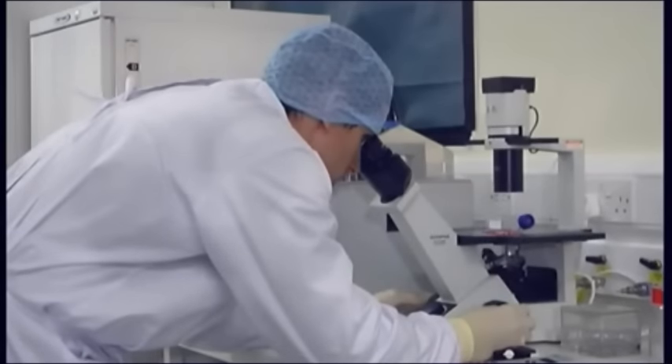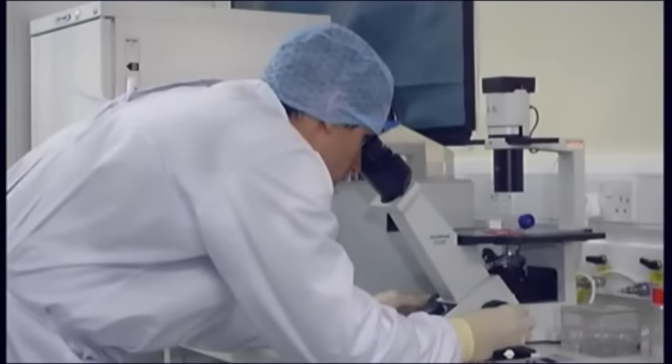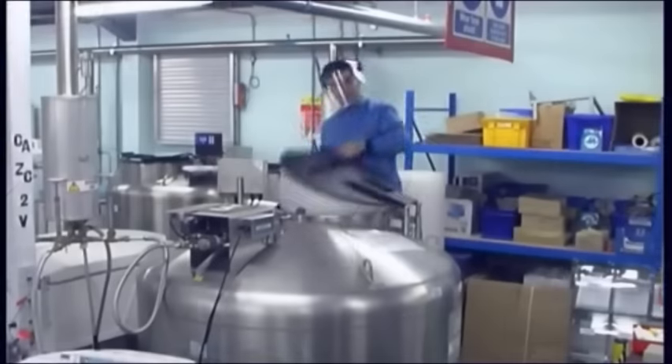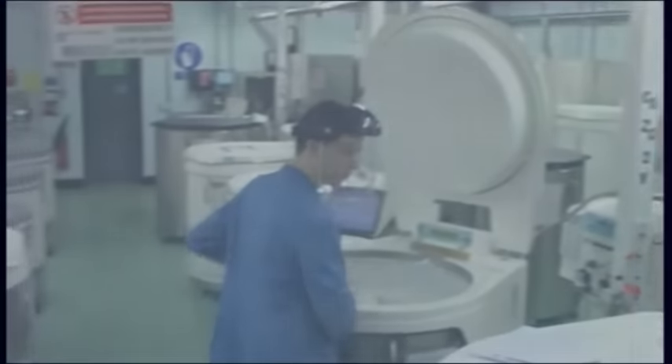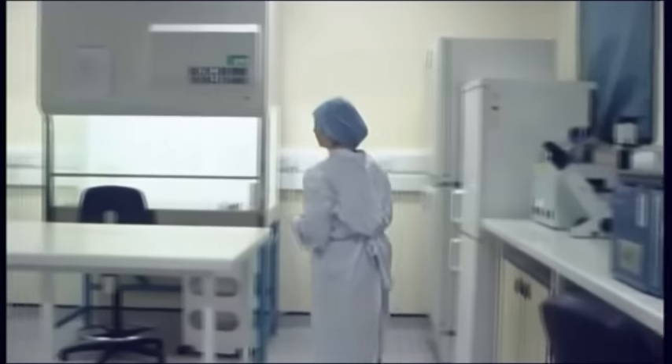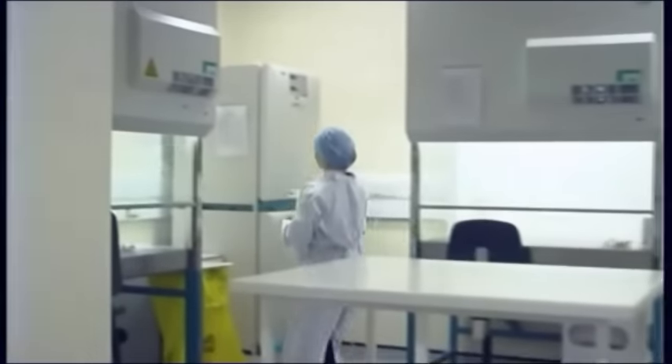Windows to the lab should be sealed, and work surfaces positioned at a comfortable working height. Areas used for the storage of materials in liquid nitrogen should have floors resistant to cracking. Now let's look at the equipment that should be found in an effective cell culture laboratory.